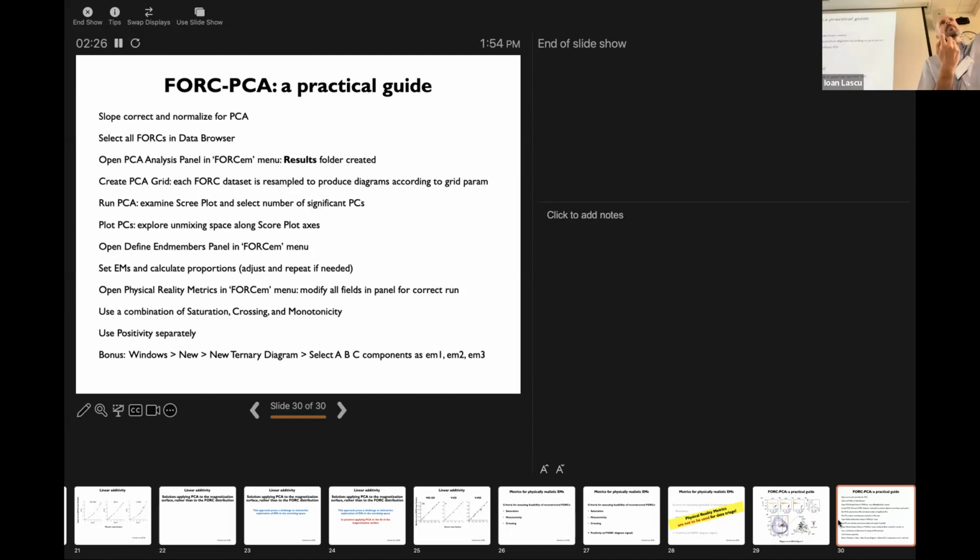So did you have a comment, Andrew? Running. So the export code that's used to calculate conventional FORC diagrams that I showed you this morning is done off a regular measurement grid. And one of the challenges of integrating that with conventional measurements is which code out there will process the data.